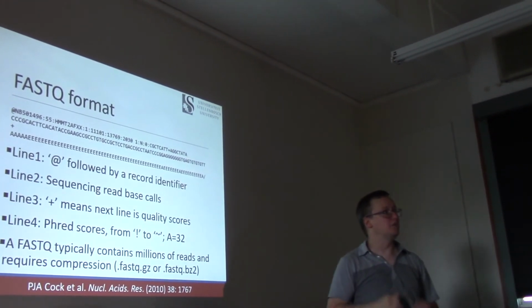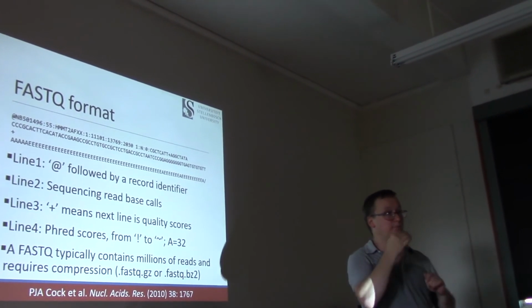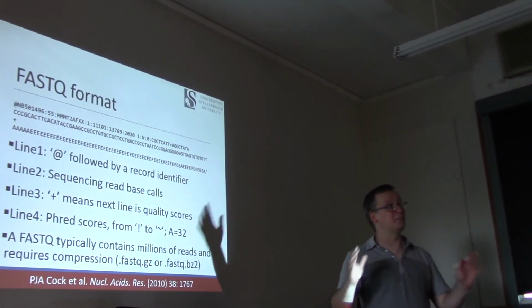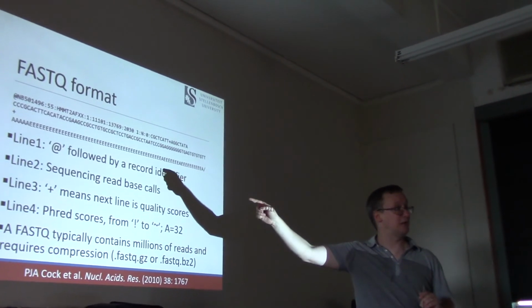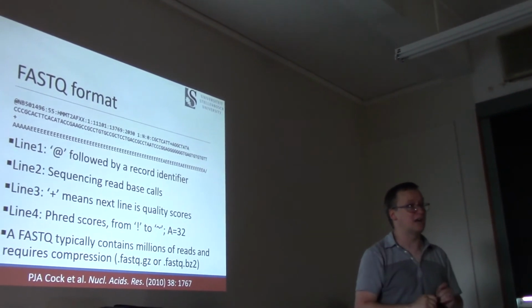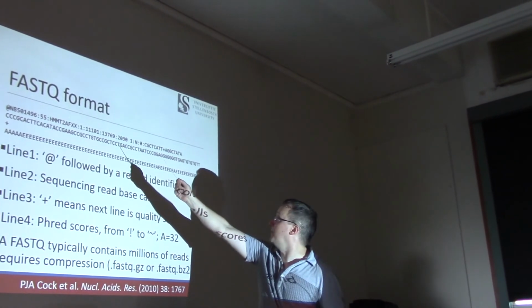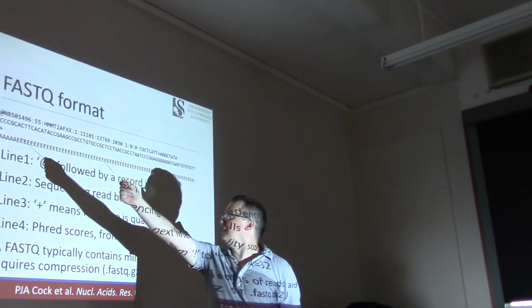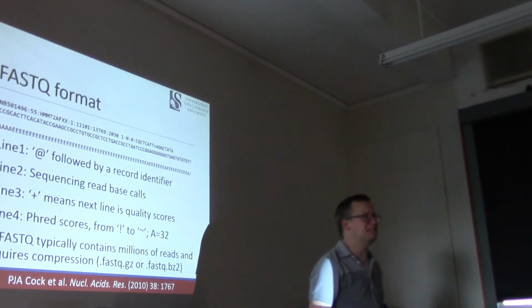Great. So that is the sequencing read. A FASTQ file is just a really big text file that's comprised of block after block of these 4-line segments. Each read is going to correspond to a 4-line block. So the sequence appears in number 2. The first one's just the address. The third line, typically, is just a plus symbol.